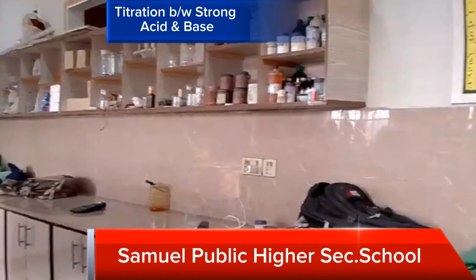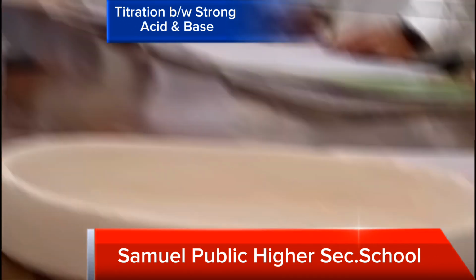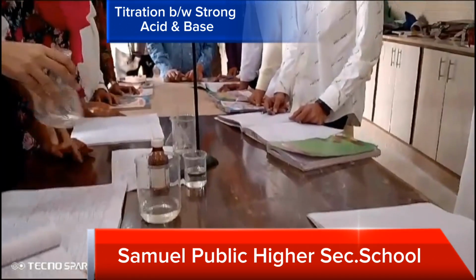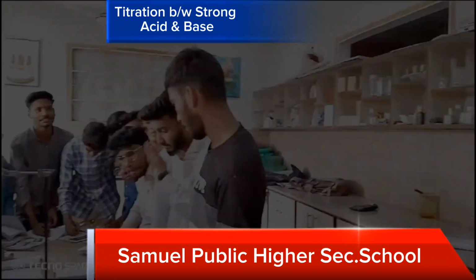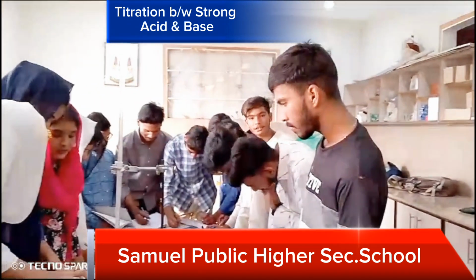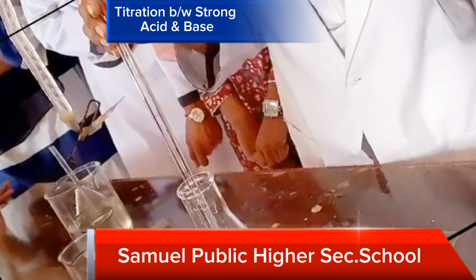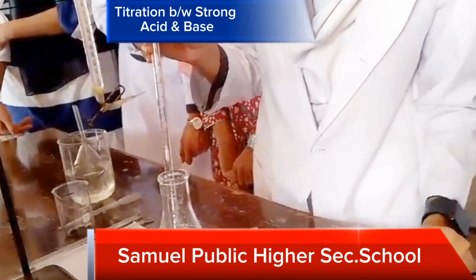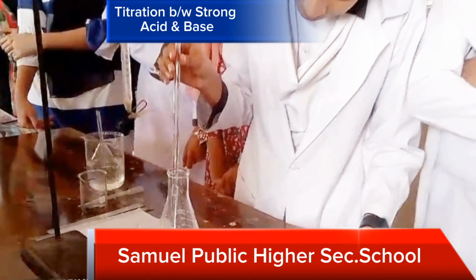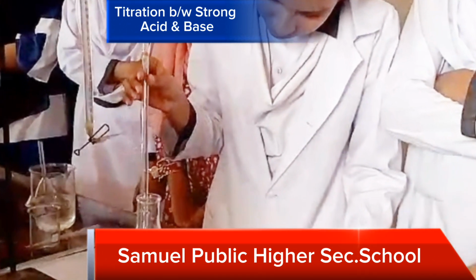To the experiment of the titration. Firstly, know about the neutralization reaction, in which chemical process an equivalent amount of an acid reacts with a base to produce the salt and the water. So this chemical process is known as the neutralization reaction.